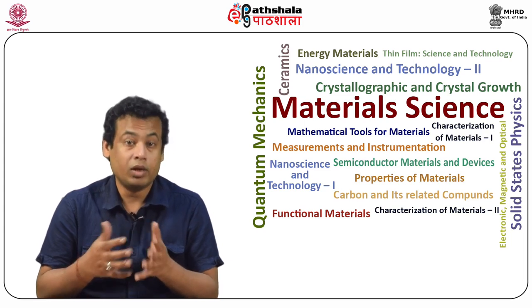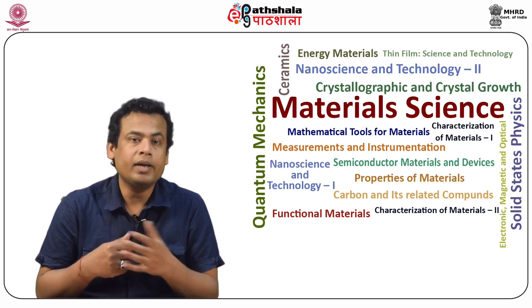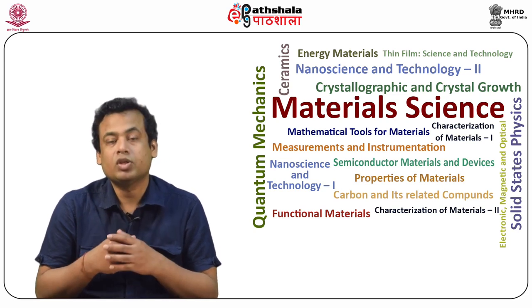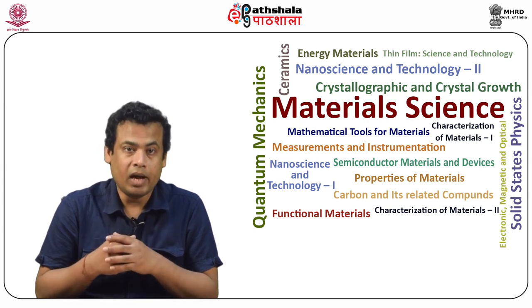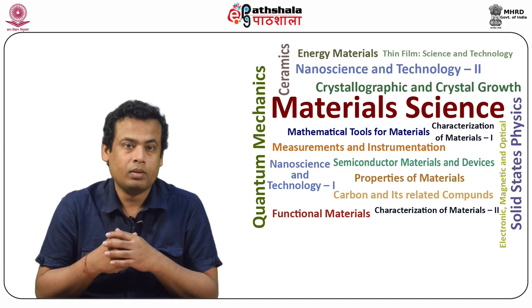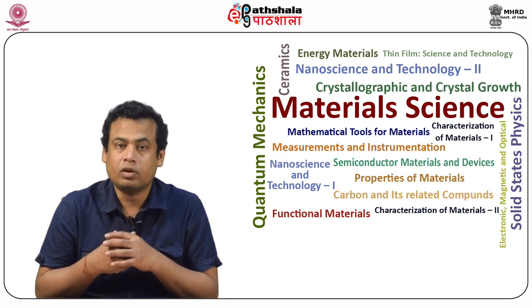A few analytical imaging techniques are also used, generally high resolution optical microscopy, scanning electron microscope, field emission scanning electron microscope, the ultra high resolution scanning electron microscope, focused ion beam scanning electron microscope, and scanning transmission electron microscope and transmission electron microscope.